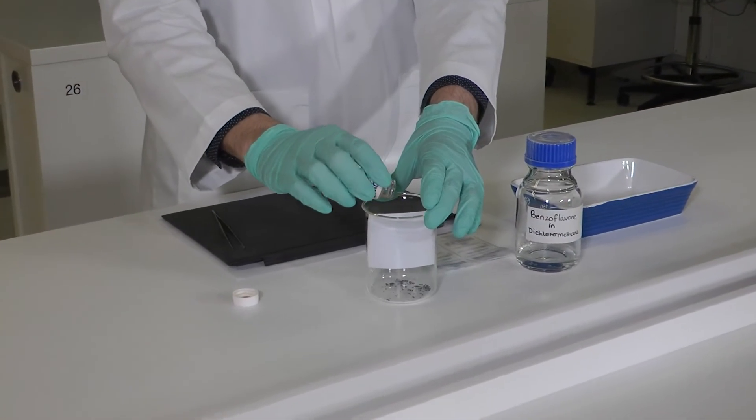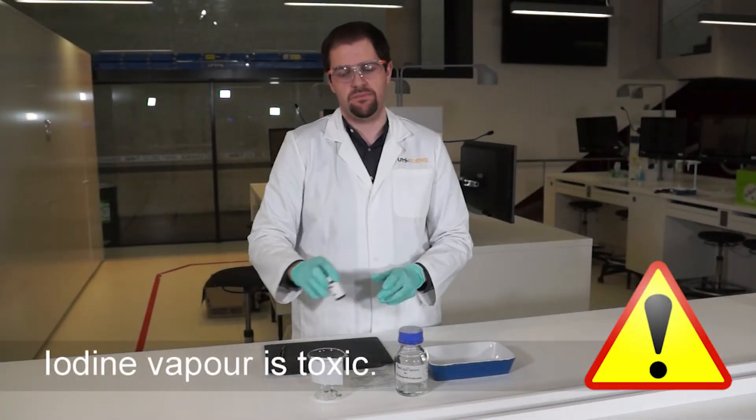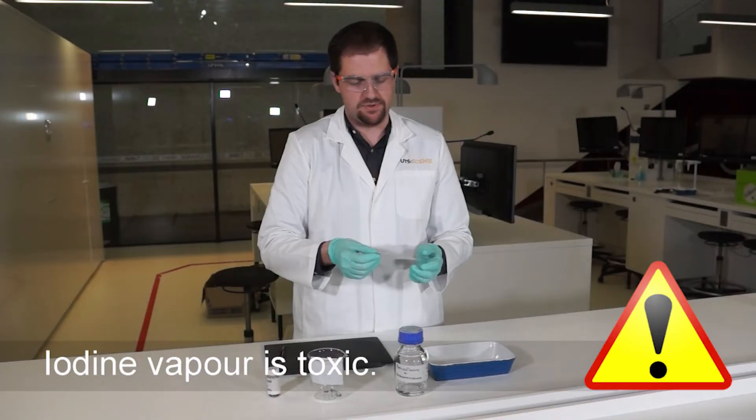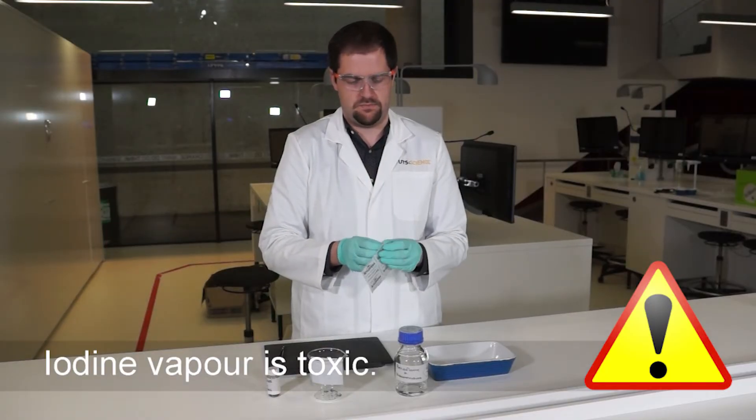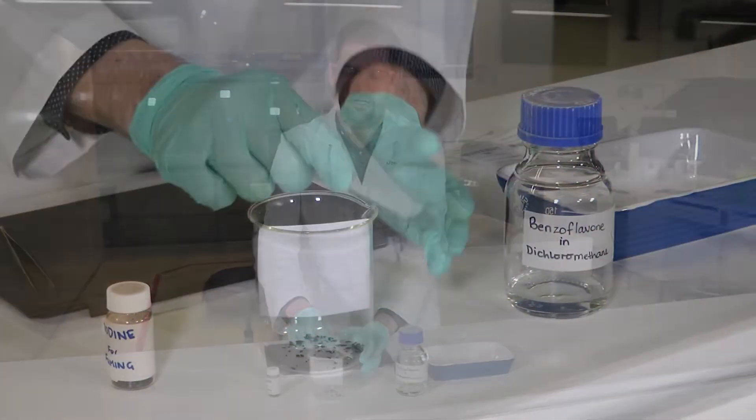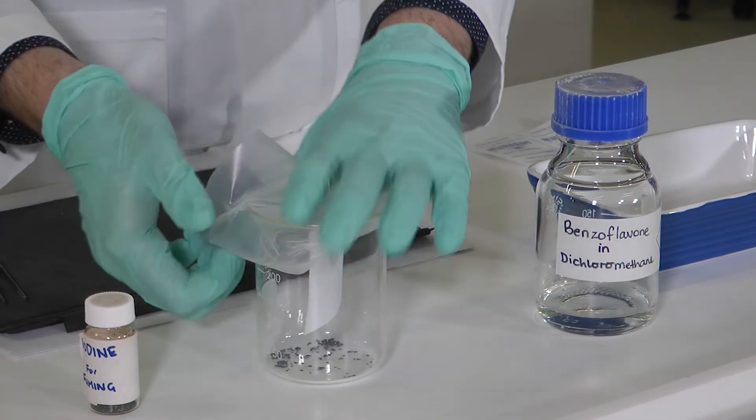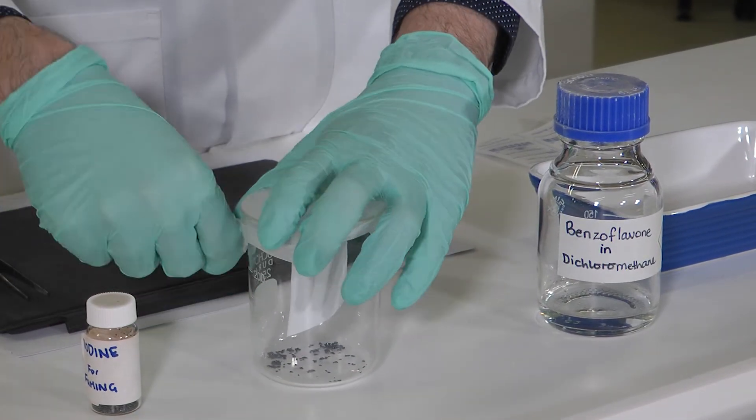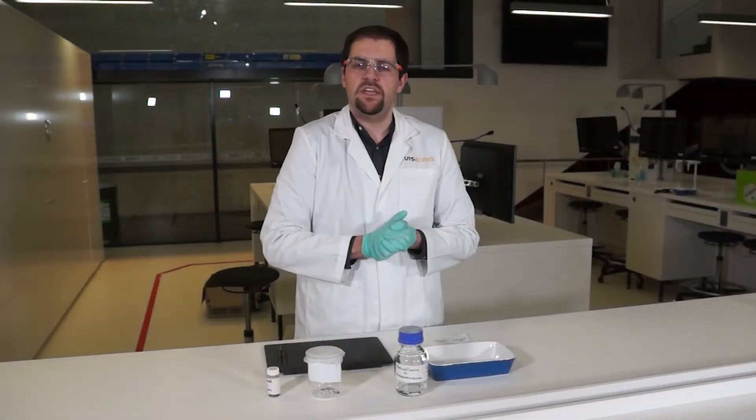Now iodine vapor is actually quite toxic, so in order to make sure that we don't have any health risks, we're going to seal it up using parafilm. By sealing it up, the iodine vapors are going to float around our beaker and make sure that none of those vapors are escaping.